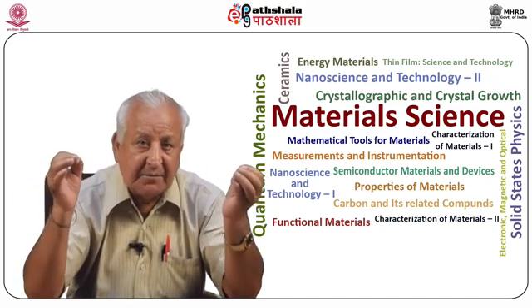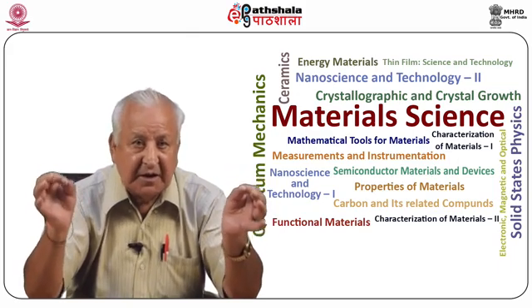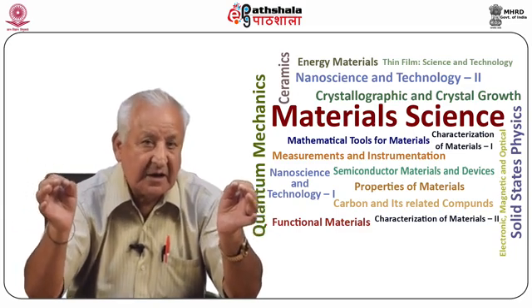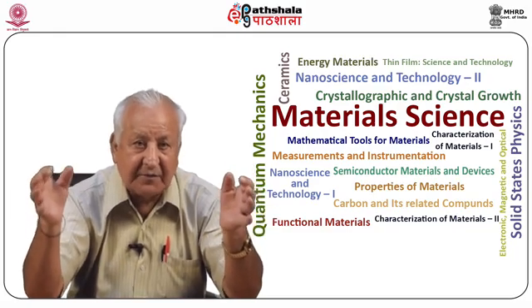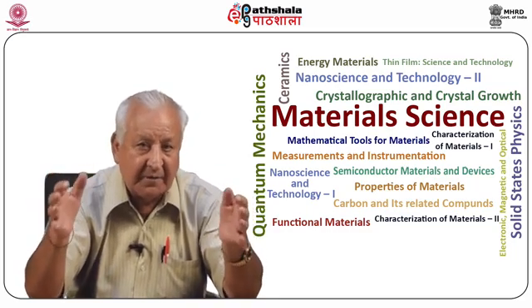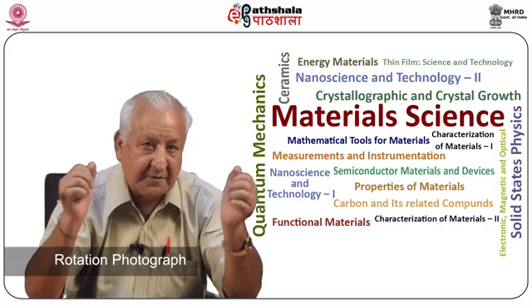The rotating crystal method was devised by Schiebold and Polanyi. Its principle is based on the fact that if a crystal is rotated slowly about a fixed axis, a large number of planes will successively come into the reflecting positions, and the diffracted radiation is recorded on the photographic plate or film in the form of a pattern of spots, popularly called a rotation photograph.